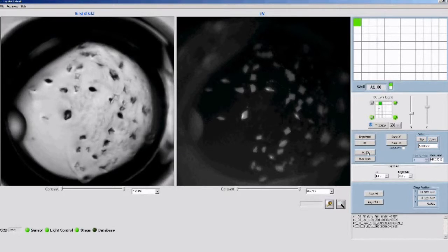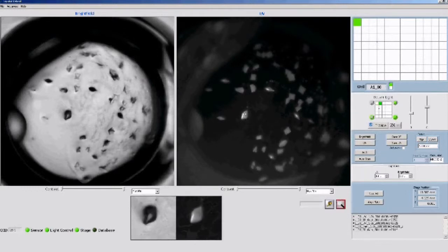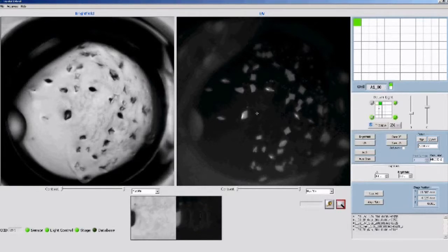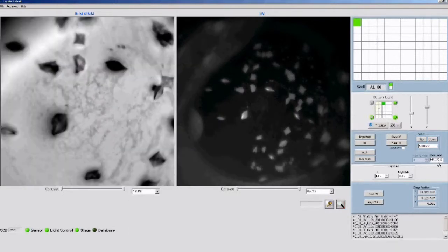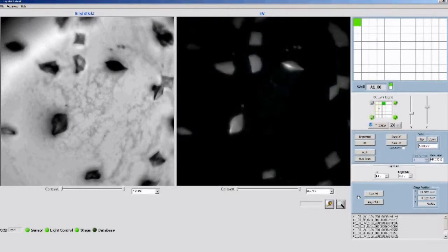What is shown on the right side is the plate configuration, which in this case is an MRC 96-well two-drop plate. One of the features that the UI has is the ability to compare the two images side by side. There is no register shift — there is a one-to-one correspondence between the two images.